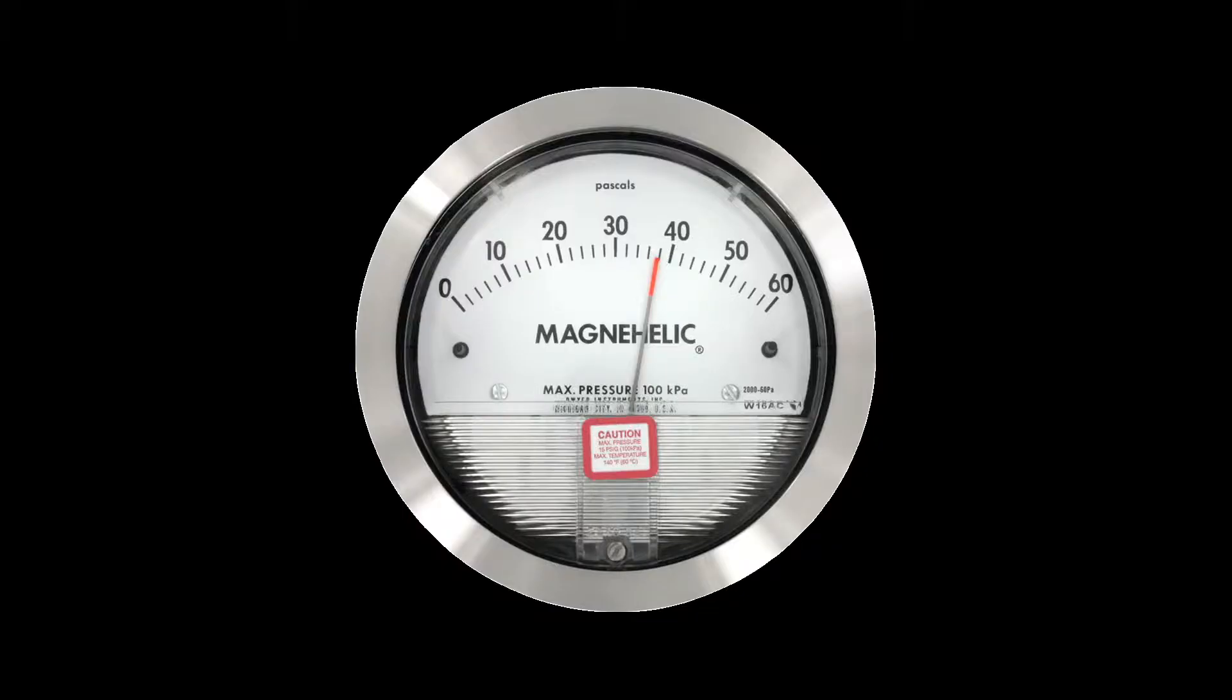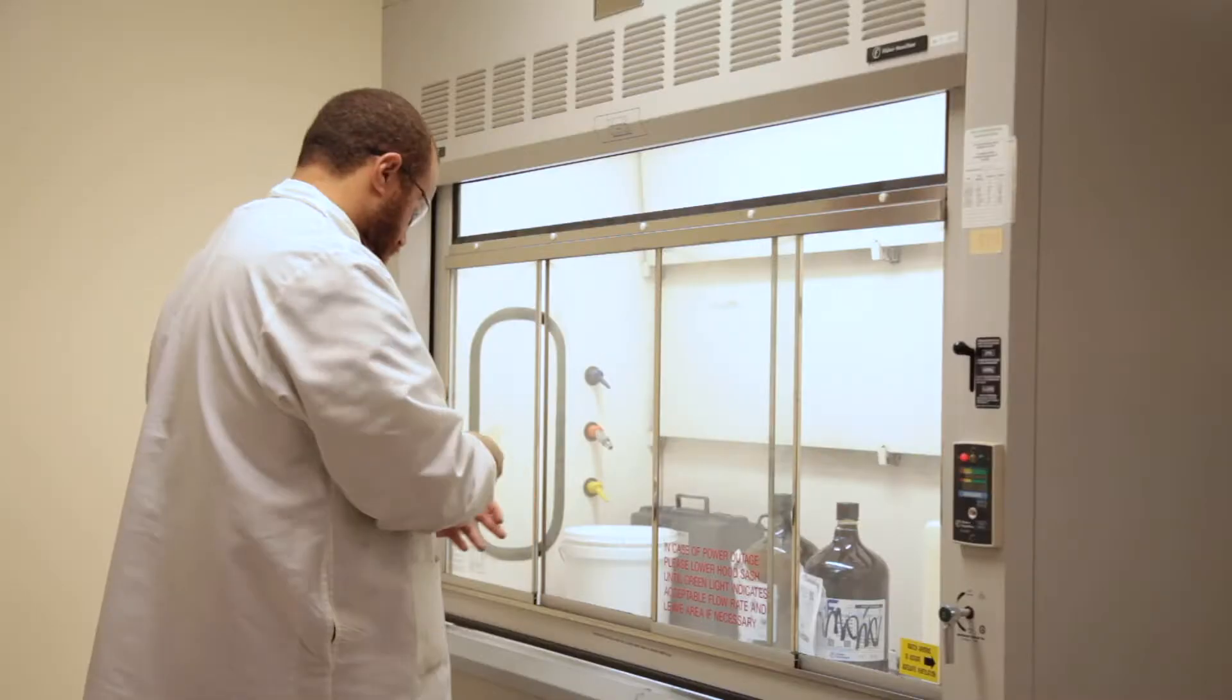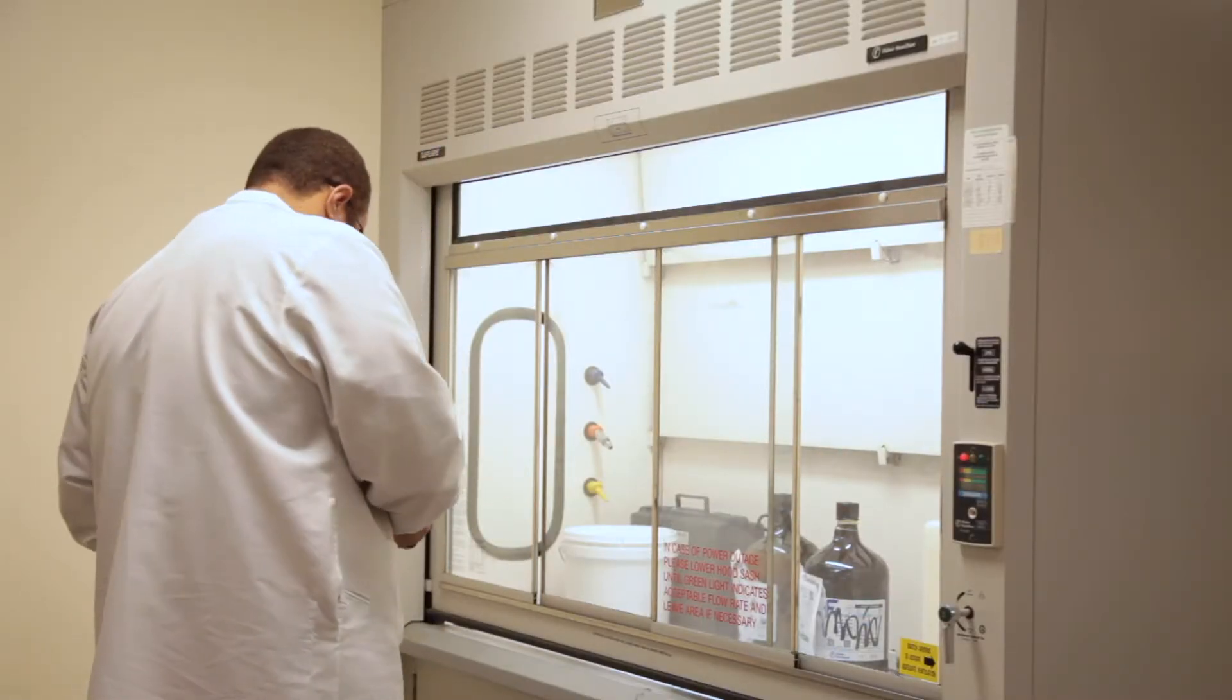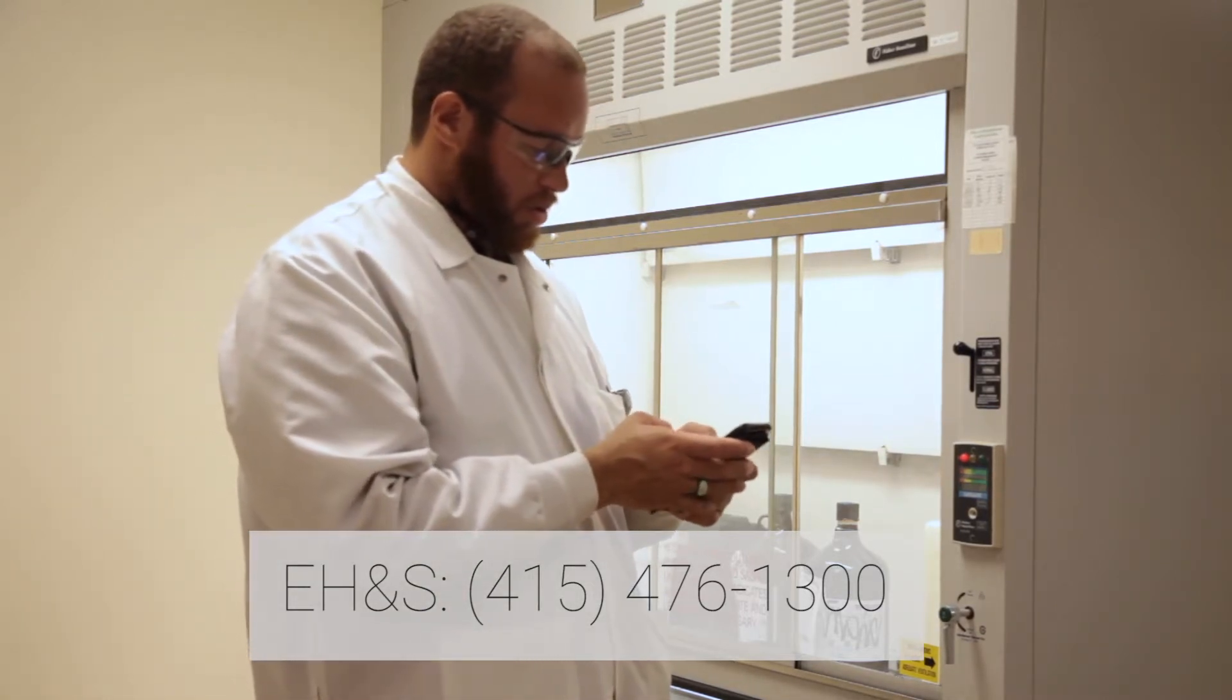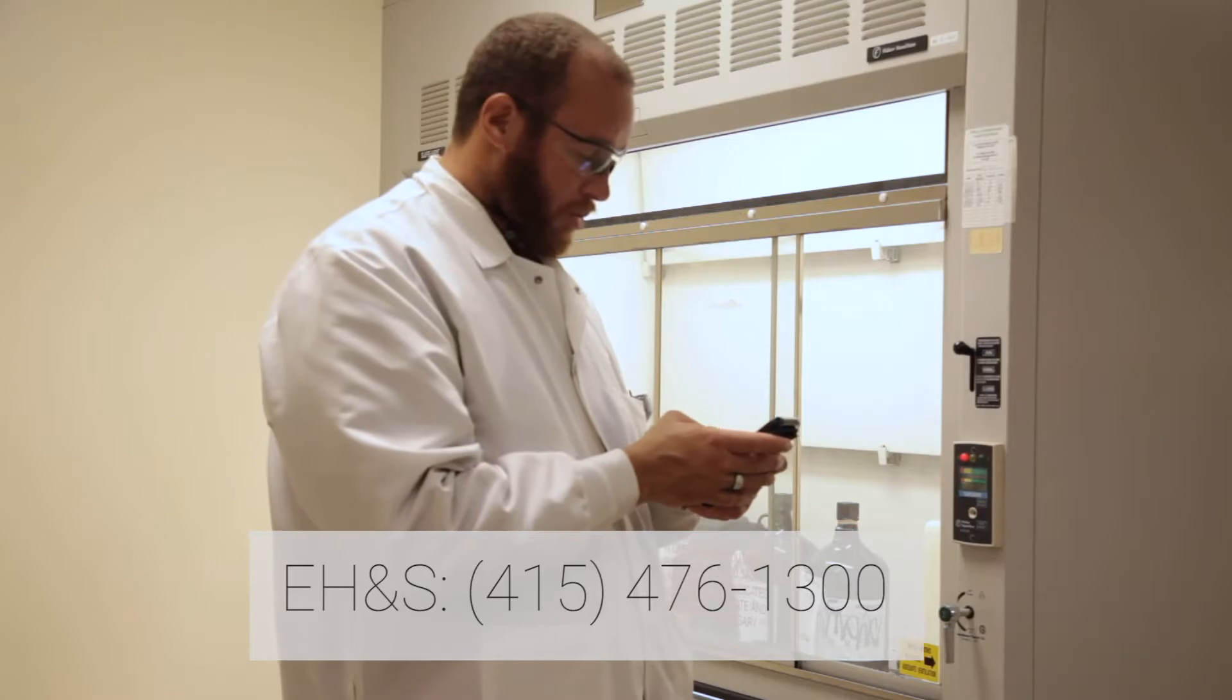If your hood has a magna helic gauge, the pressure reading at the time of the last certification will be noted on the certification sticker. If the current reading varies significantly, your fume hood may not be functioning properly. Contact EH&S at 415-476-1300 to have the hood inspected.